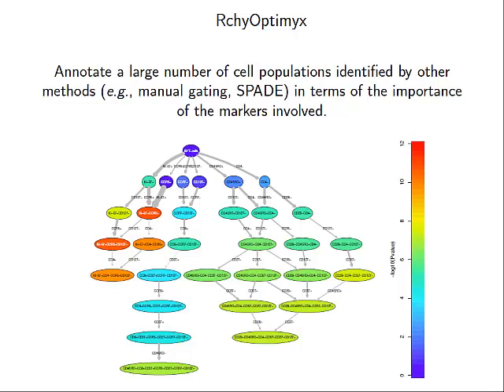It varies a lot. I can tell you what's not going to work is 3. I have worked with 3 microarrays. That's a common experiment. Yeah, but that doesn't work for flow. No, 3 will not work for flow. We've tried it in some of the examples. But if that's all you have, then it's really up to the biologist. What you can't do is come to me with 3 samples and I tell you this one's different and it's 20 versus 21%. Then you can't argue with me at that point, right?